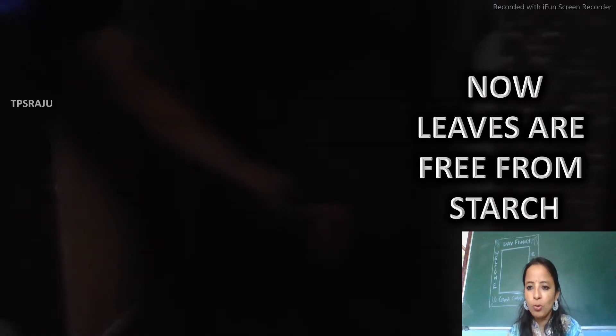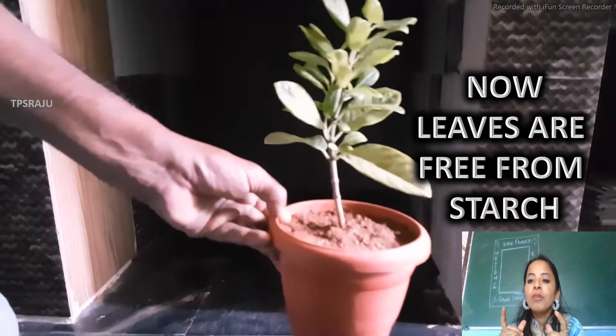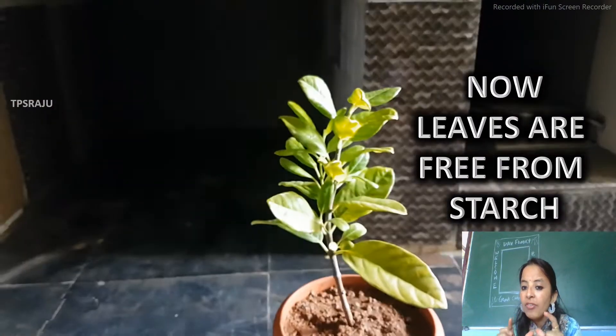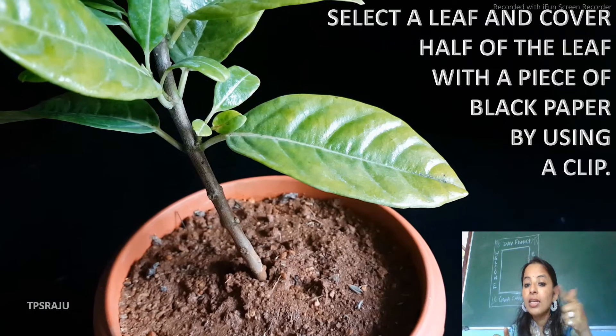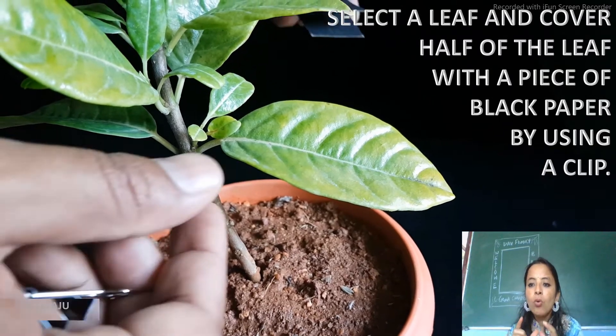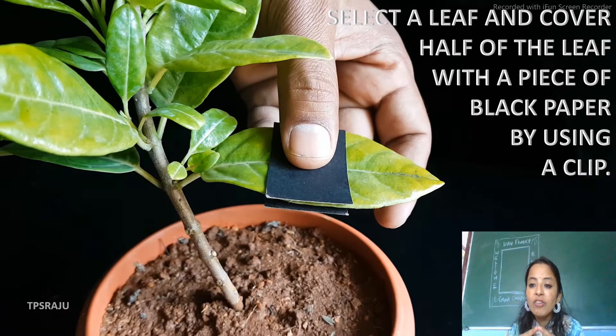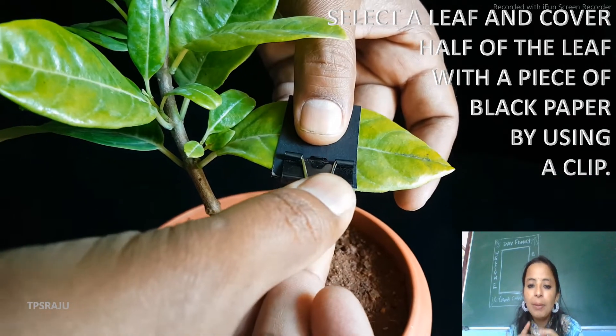After a week, we will take one of the leaves. That leaf is now free from starch because we had kept it in a dark place. Now we will cover half of the leaf with a piece of black paper by using a clip.